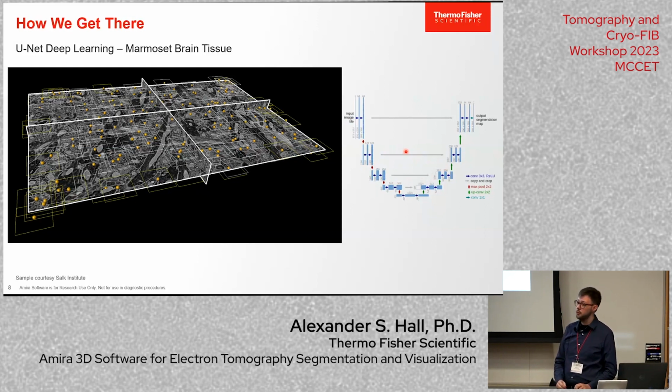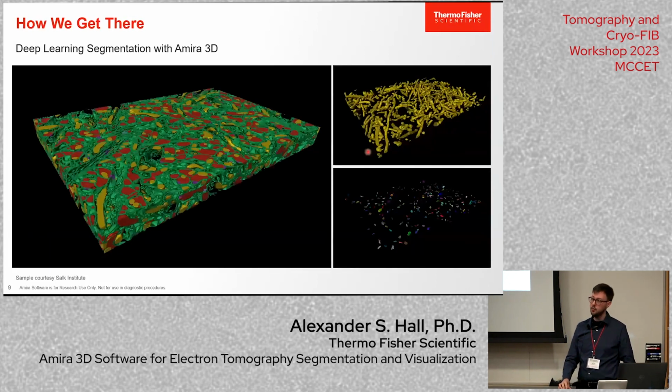We're trying to improve at each iteration with a lot of random guesswork along the way. What are good parameters for all of these individual mathematical operators, which are called layers? So quite a bit of computation goes into this guesswork, but the output is pretty impressive.